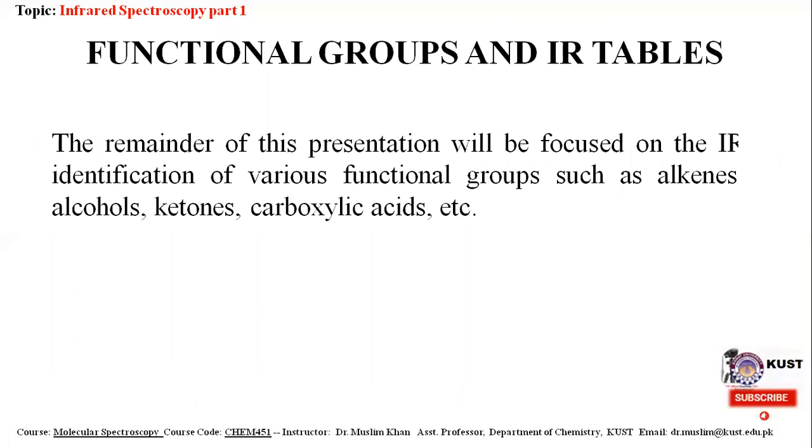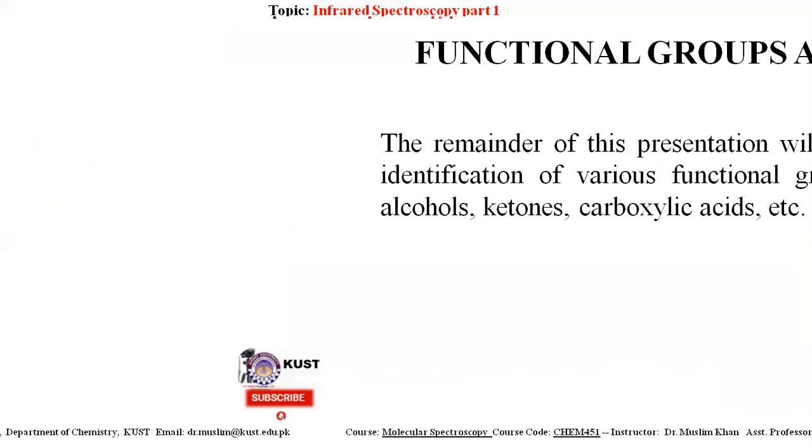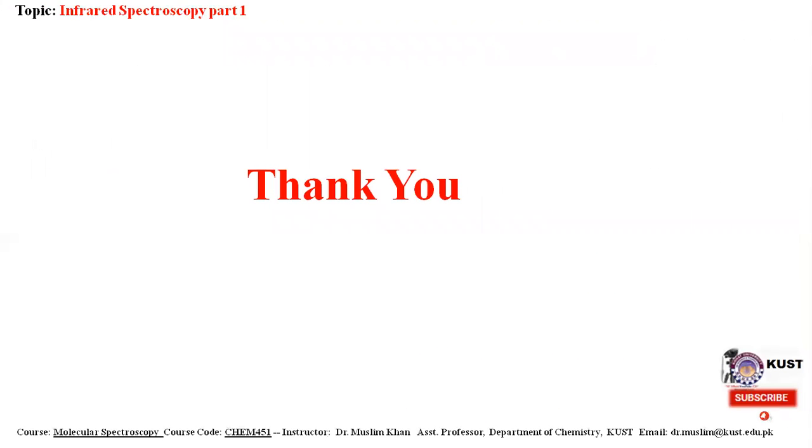The remainder of this presentation will focus on the IR identification of various functional groups such as alkenes, alcohols, ketones, carboxylic acids, etc. And thank you very much for today's lecture.